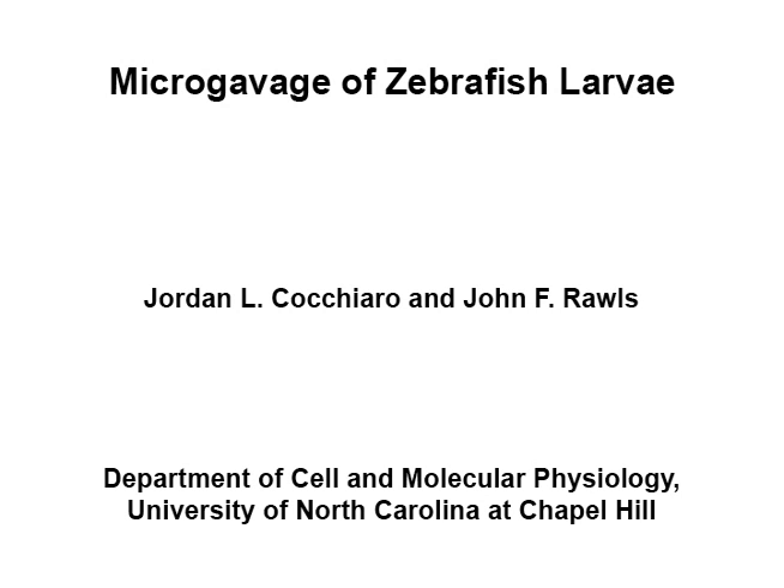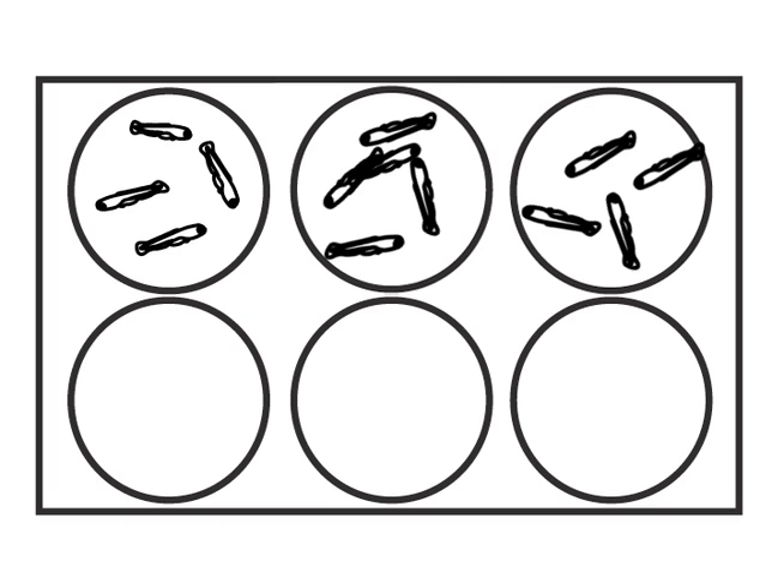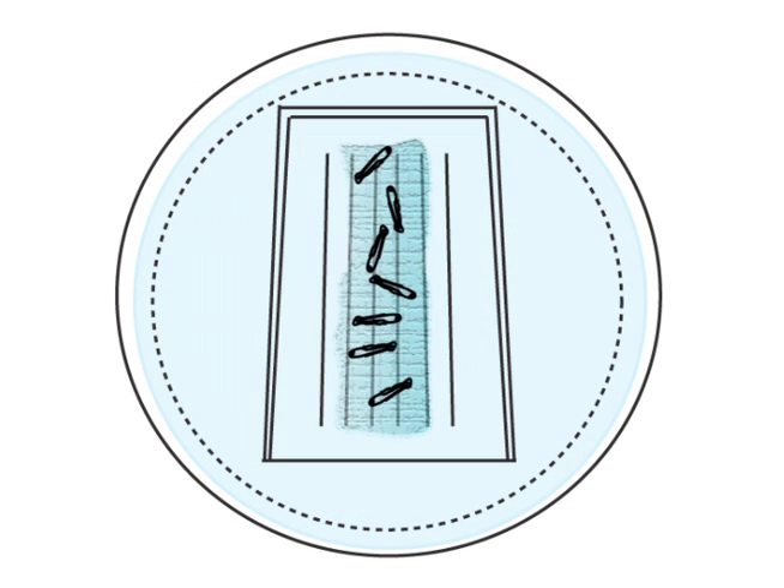The overall aim of this procedure is to orally administer materials to the intestinal lumen of zebrafish larvae. The larvae are anaesthetised and placed onto an injection mould lined with methylcellulose.